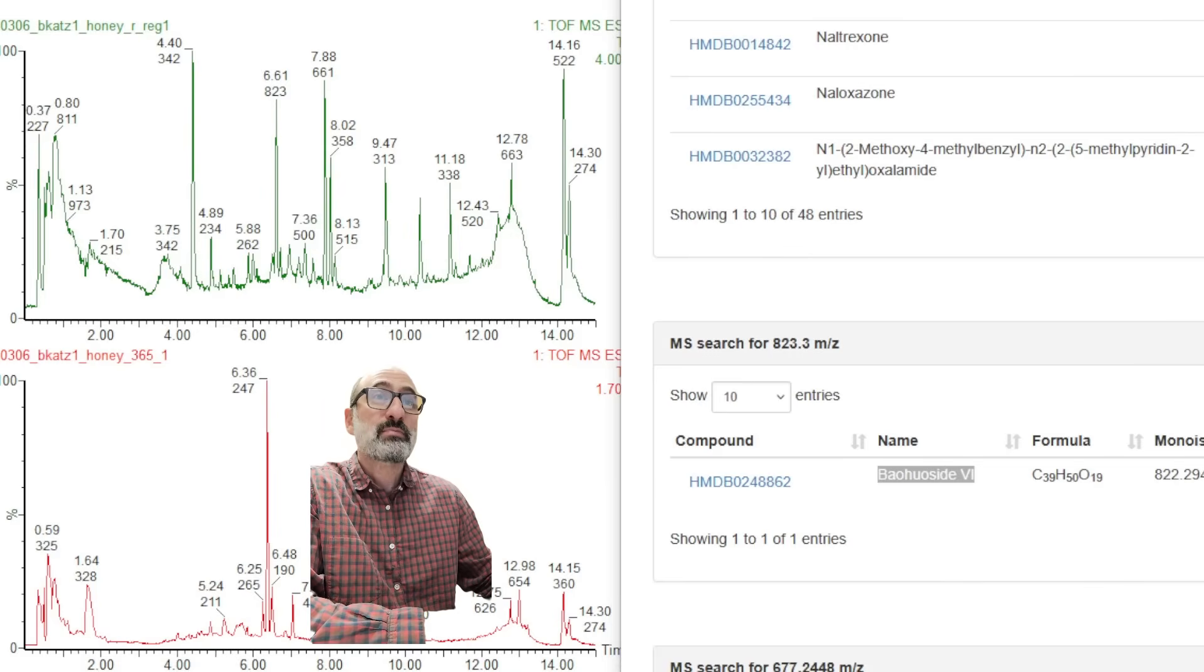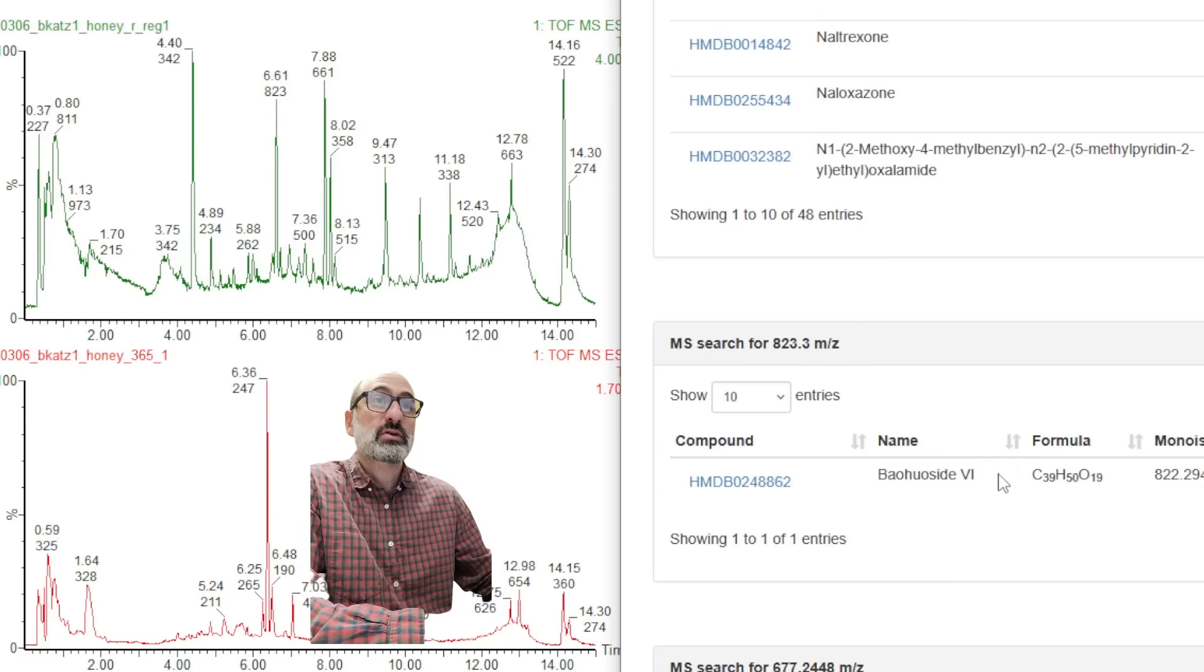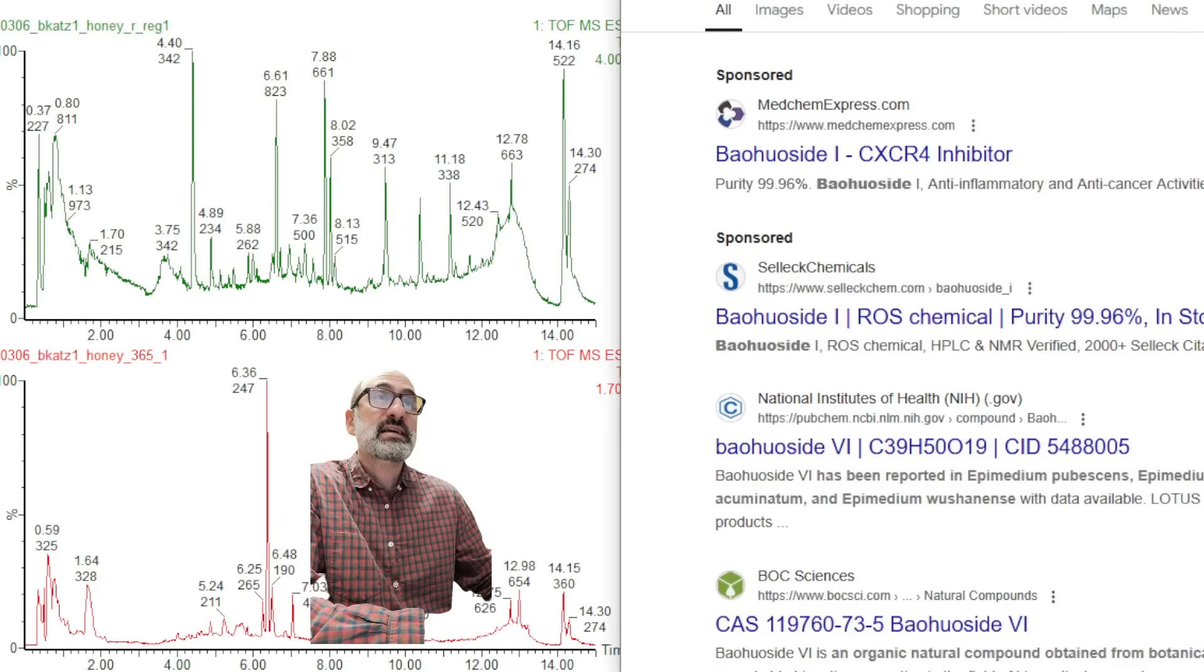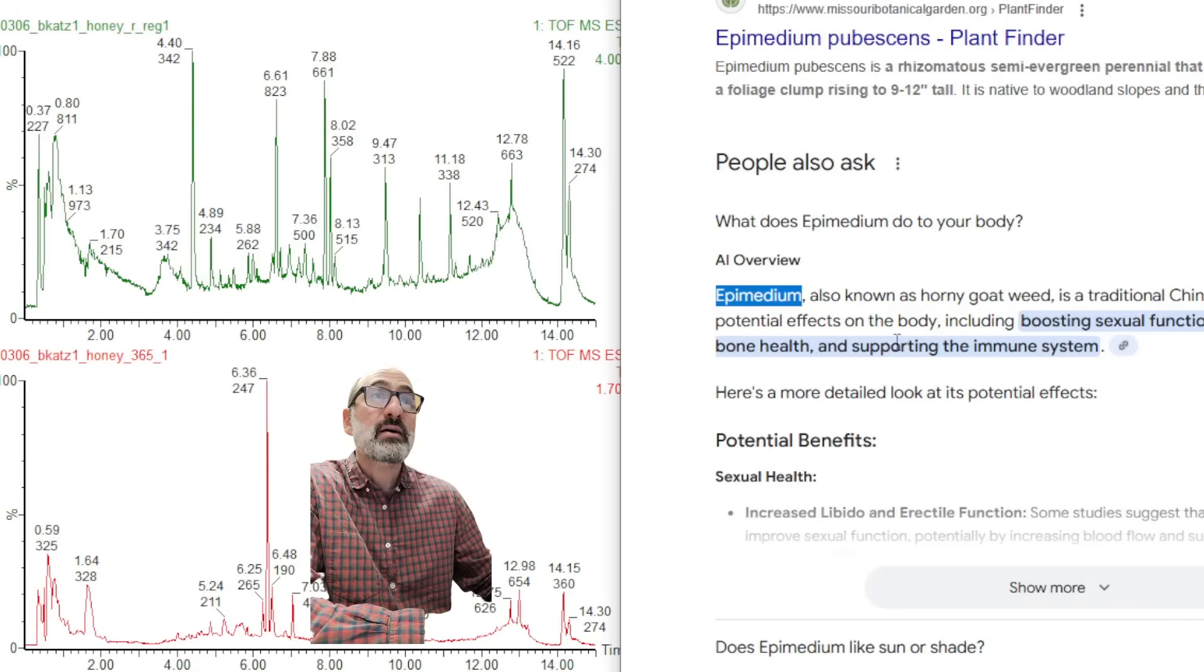823 peak is Baohuoside VI? I guess 6? I don't know. That's a strange one. Let's search this guy out. Okay, so this is coming from Epimedium... I think, you know, I'm not an expert on my plants, but I think that could be horny goat weed. So, Epimedium is known... Better known as horny goat weed.